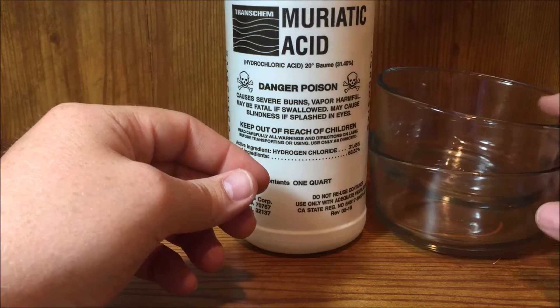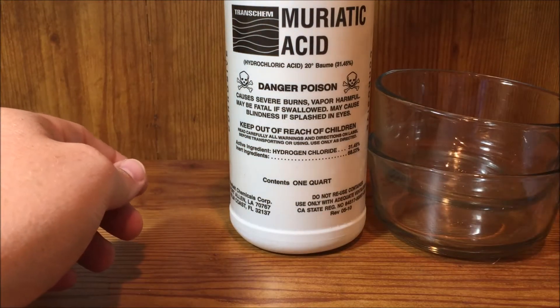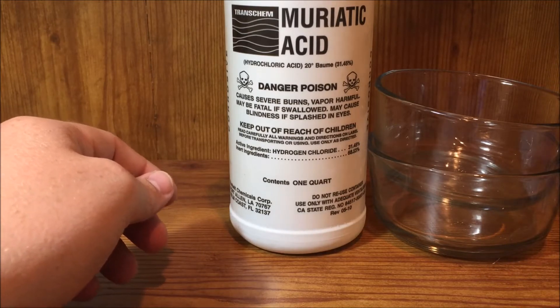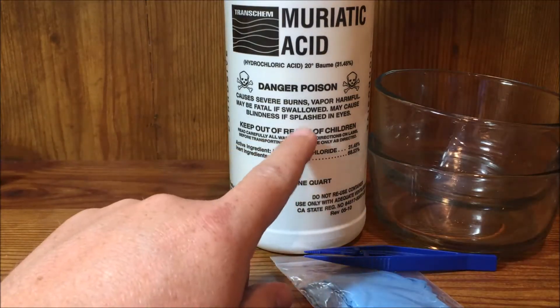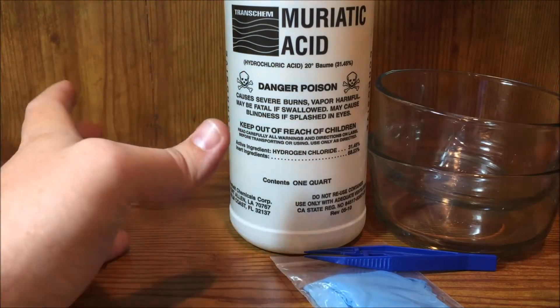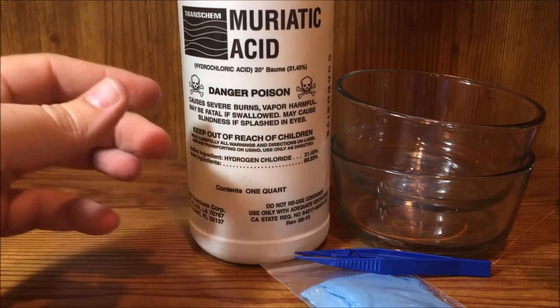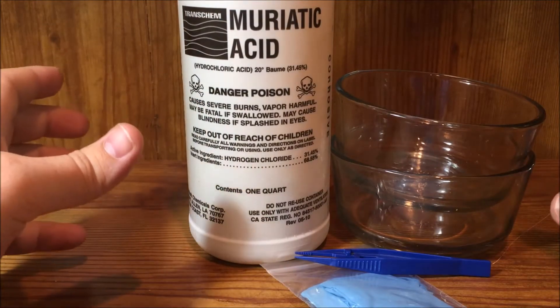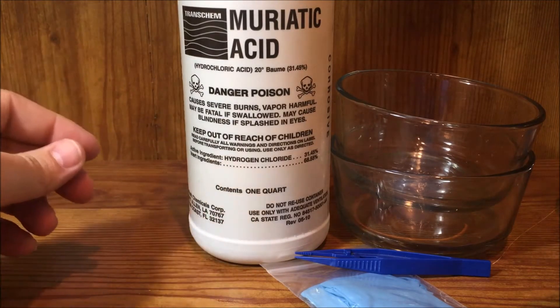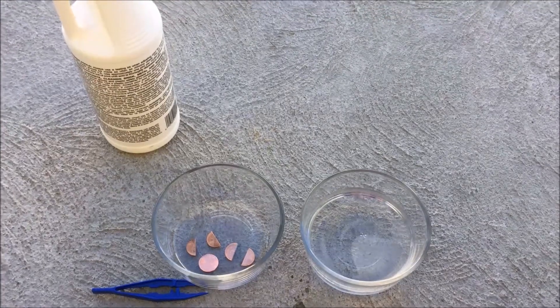I have two containers — I'll put the acid in one and water in the other, so when I'm done I can take the pennies out of the acid and rinse them off in the water. To avoid vapors, we'll be doing this outside. I'm going to move outside, set this up, let you see what the pennies look like in the acid, and then we'll come back in to look at the hollowed pennies at the end.